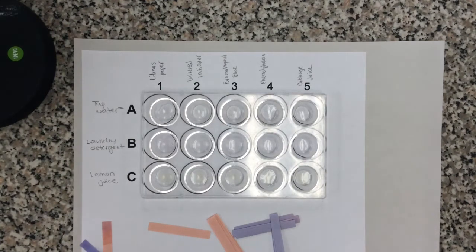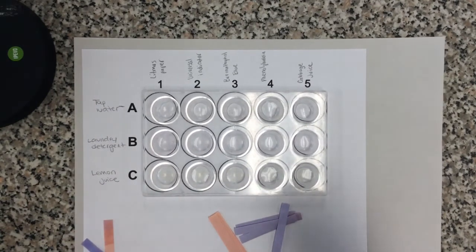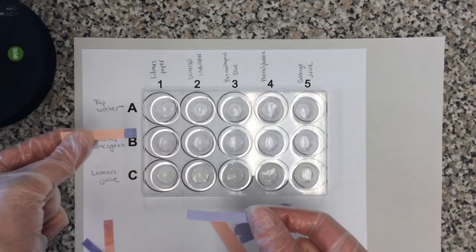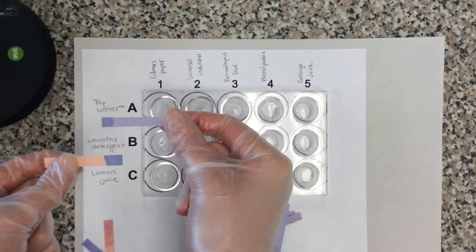Next up, we are going to test out the laundry detergent as well. Okay. Red litmus paper. Whoa. So that turned blue. And it remained blue.